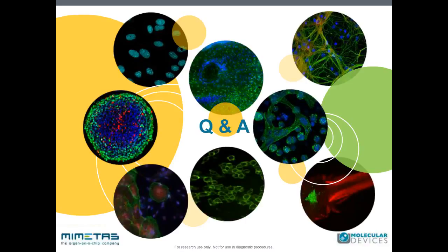So in terms of organoids per lane, it's usually in the range of about 10 to 20 organoids in a single lane. You can see them more densely or less densely depending on the type of readout. If you have swelling, for example, they can really swell up. And the types of readouts also determine the amount of time that it takes.